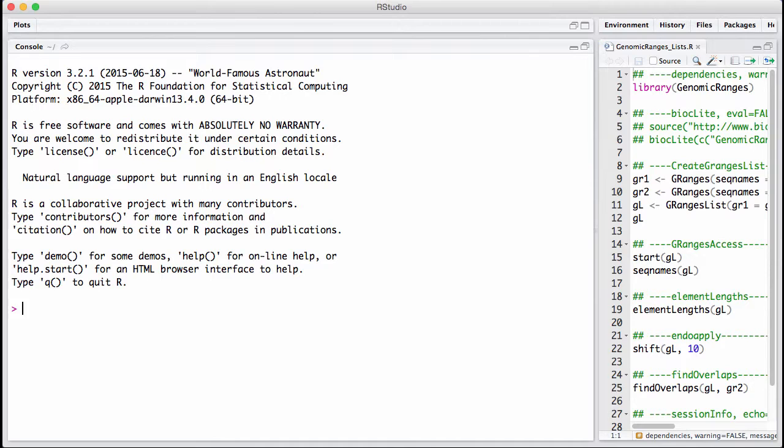In genomic ranges, we have a lot of lists or xx lists where xx is some class. For example, a gRangers list. There's also an integer list and other things.